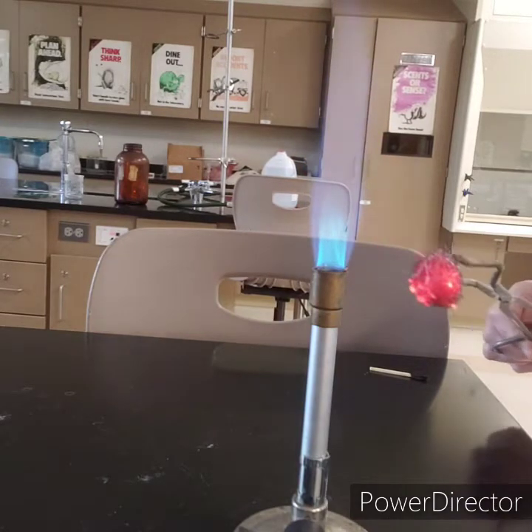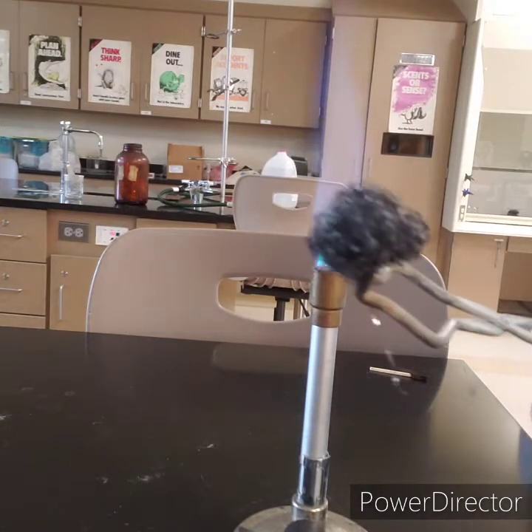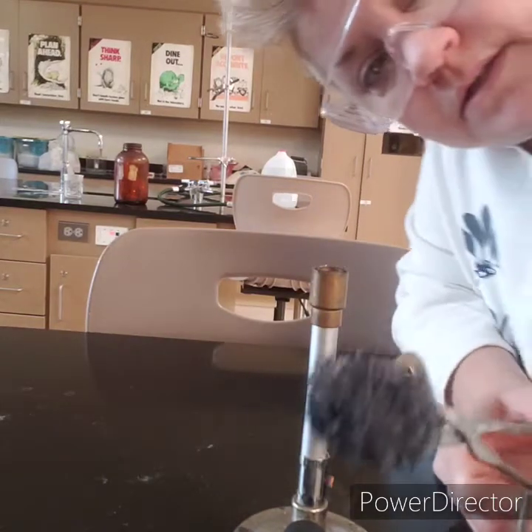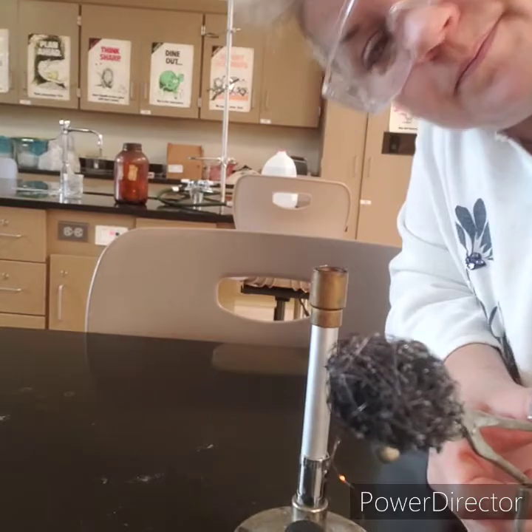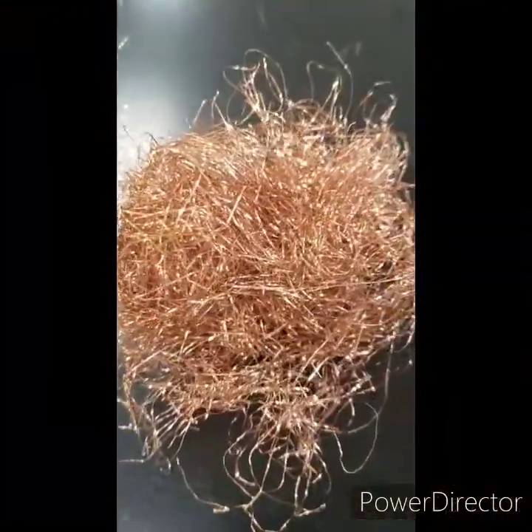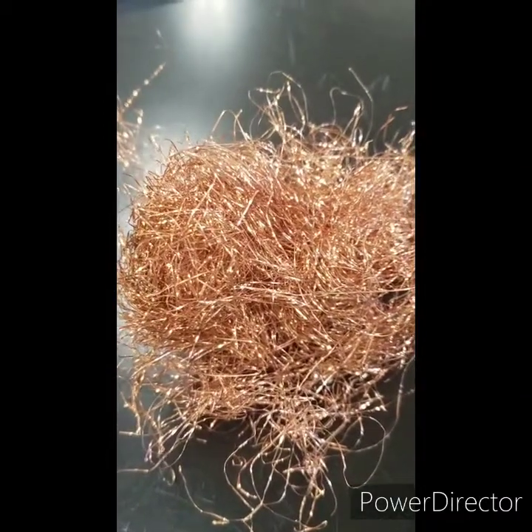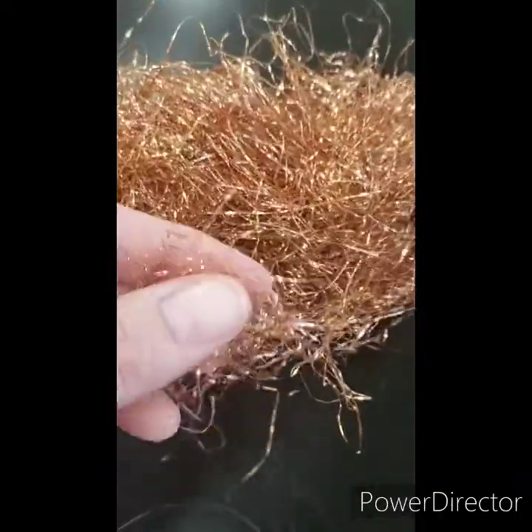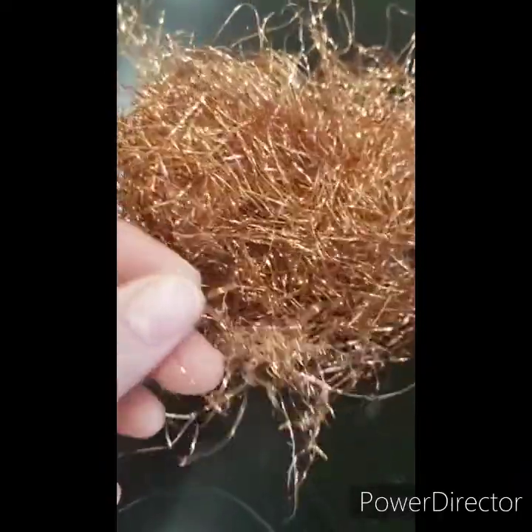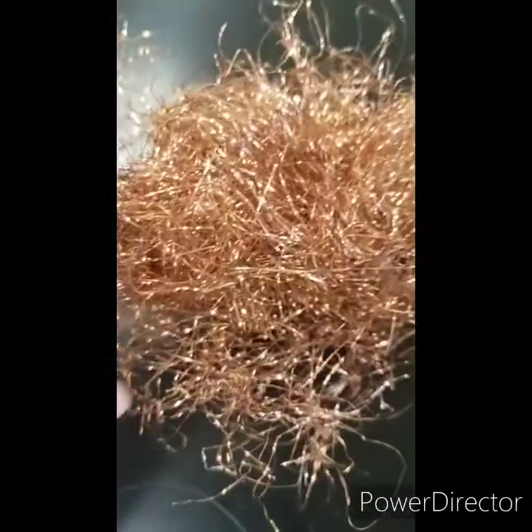I think we're done — that looks pretty burnt. Now we're going to compare this to the unheated copper and look at the differences in the properties. Here's our copper before heating. It's a metallic orange, obviously made into a wire. It's very flexible, malleable, ductile, and shiny.